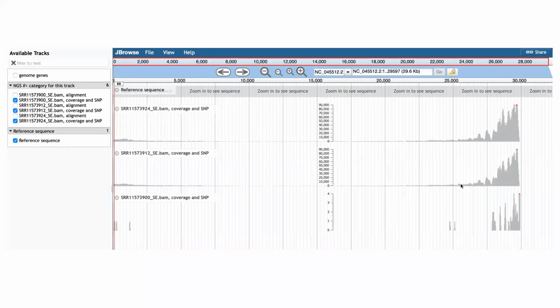So there are a lot of mapping quality issues that come up from amplification and library preparation techniques that also play a role in what we can actually identify. So if we see just some random section covered with a number of reads, that does not mean that the whole virus is there. If the main portions of the genome are not present, that means that the virus is not present.